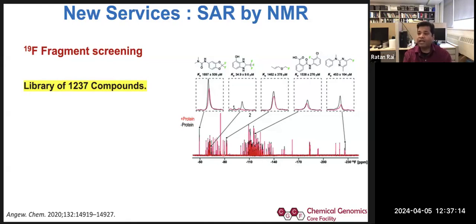And if you have a completely electronegative protein, it might hamper it. But I have one experience with a screen I am doing with Professor Millie Georgiadis on a DNA binding protein, and one of those sites is quite electronegative, but still I'm not seeing any interference from this particular library.